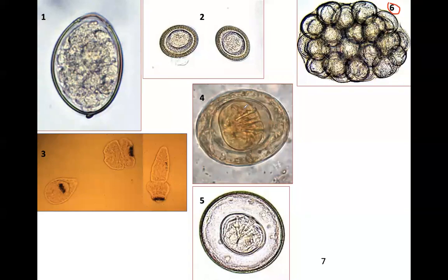last one. This is an easy one also. What do you think number four is? It has polar filaments. It has hooklets.